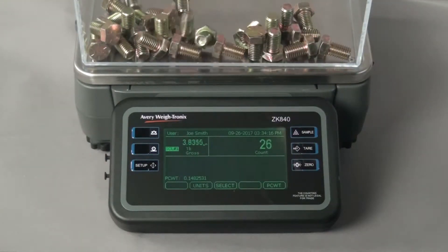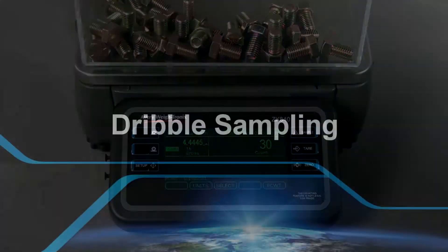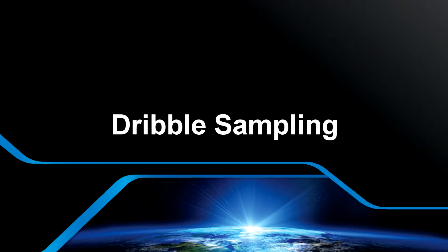As pieces are added to the scale, the ZK840 displays the count. In the next example, we will count some small plastic beads on the same scale. This time we will use the dribble method.